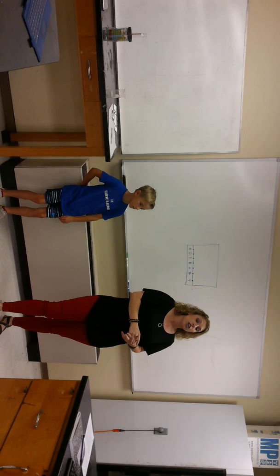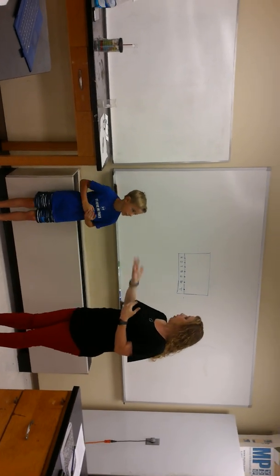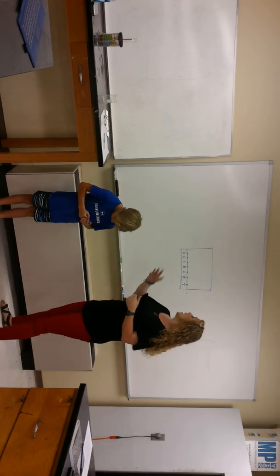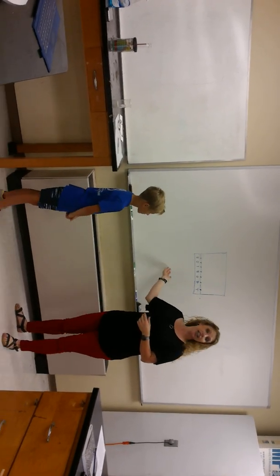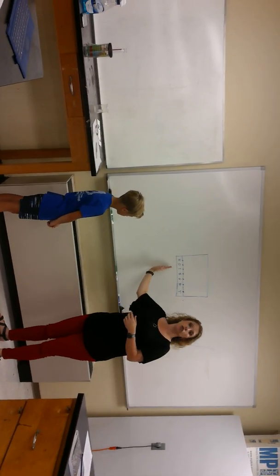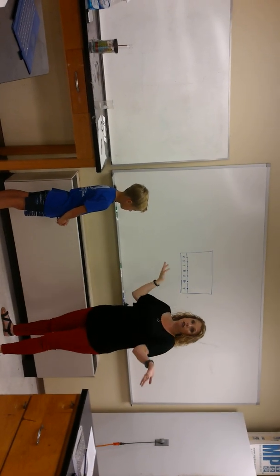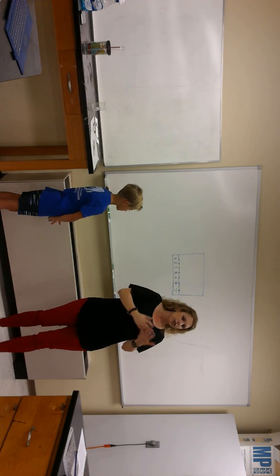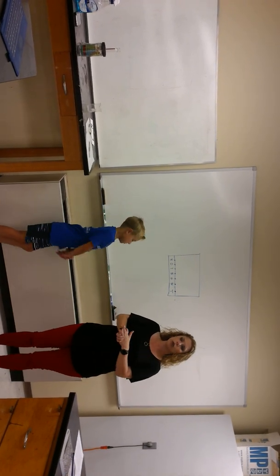So what we're going to do is we're going to see how many different types of M&Ms our friend can eat. If it has yellow dye number 5 in it, he can't eat it. And again, don't just assume that the yellow is number 5. It might be number 40, okay? So we've got to do a problem with that. To figure that out, we're going to use chromatography.